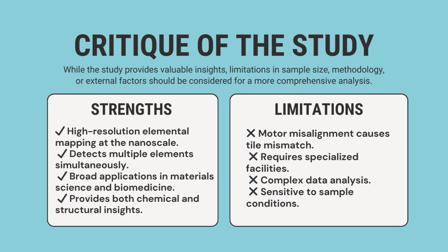Before wrapping up the study, here is the critique of the study. First, with the strengths: high resolution elemental mapping at the nanoscale, detects multiple elements simultaneously, broad applications in material science and biomedicine. The last one provides both chemical and structural insights.